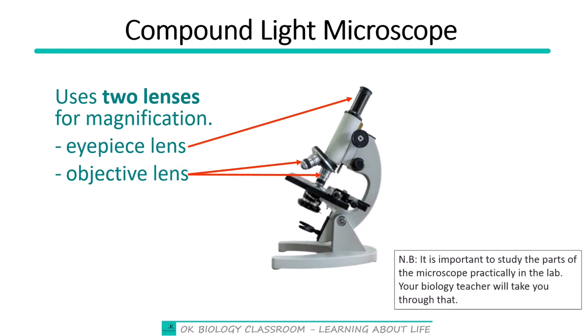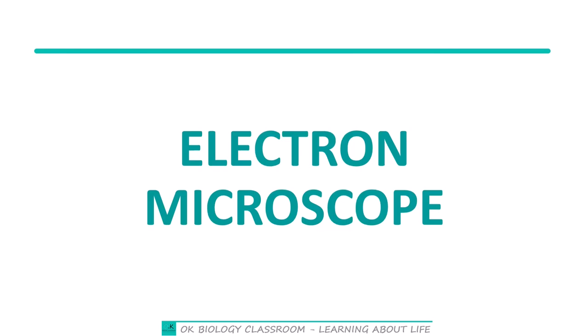Now let's go to the other, which is the electron microscope. But don't forget that we are not going to deal with all the parts of the compound light microscope. Yes, because as I've stated down there, it is important for you to study these parts with your teacher practically in the lab. So your biology teacher will take you through that.